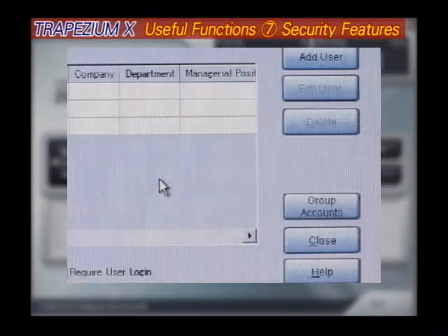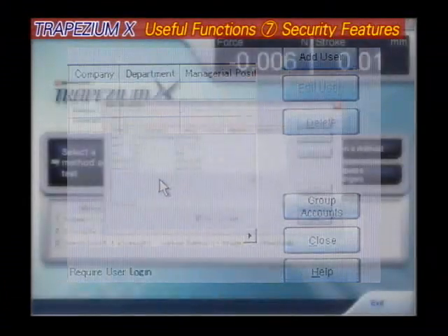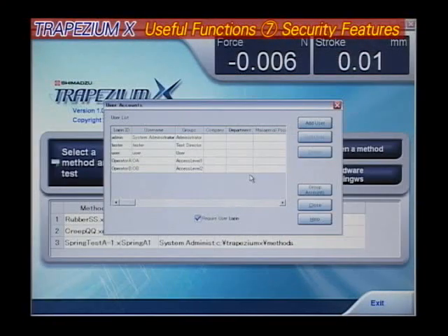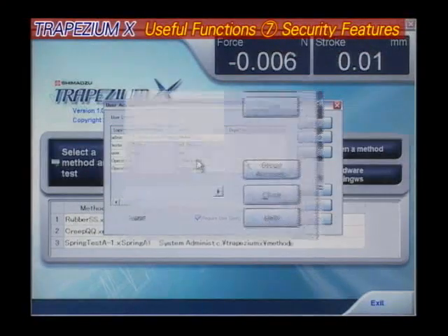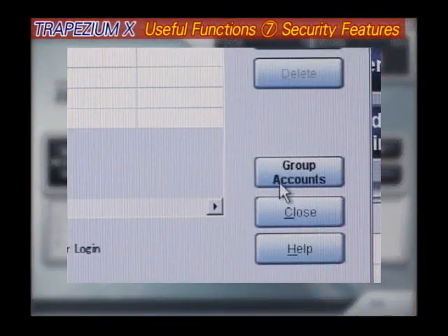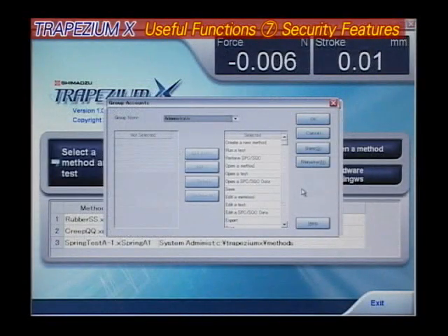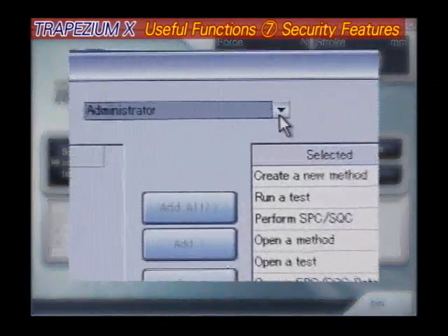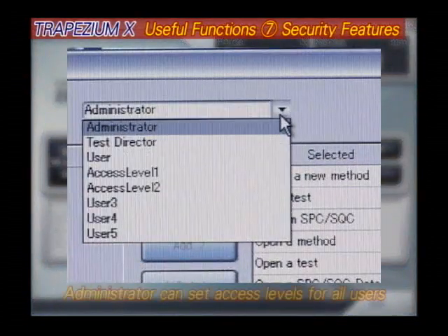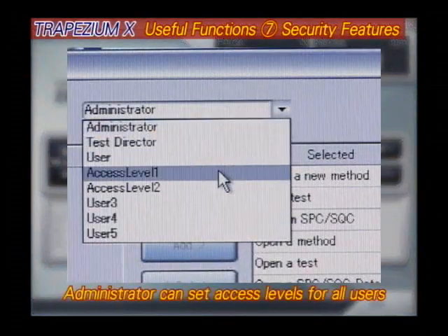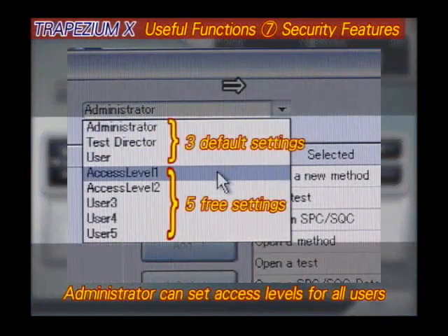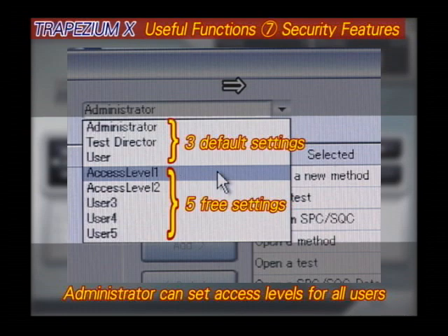Security features. Every effort was made to maximize data security, resulting in eight user access levels. Furthermore, the system administrator can personally specify all user access levels, except for the three levels designated by default settings.